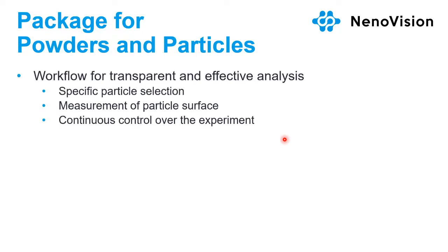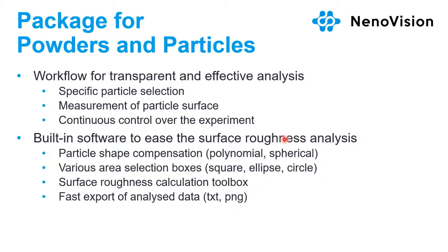So right now I showed you a package we prepared for powders and particles. We went through a workflow which is transparent and effective, as we can choose a specific representative particle, measure on the particle, and continuously control the experiment.